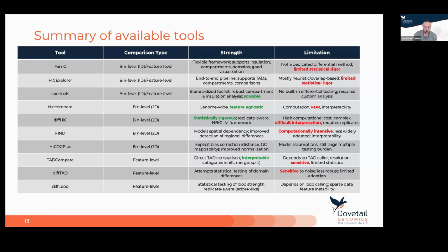It makes it a lot harder to interpret results when it's not a file that you can easily open in Excel, for example, or read directly in an easier way. They tend to be more sensitive, but also a little bit hard to interpret.